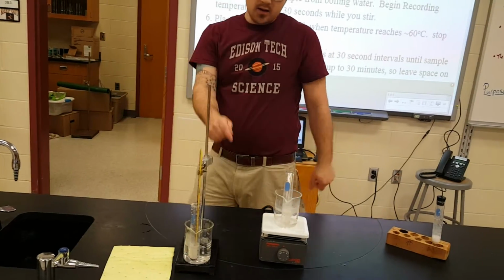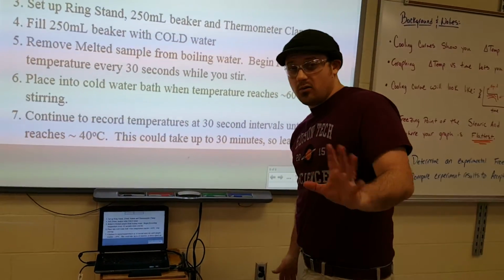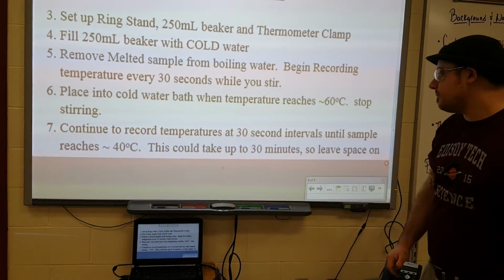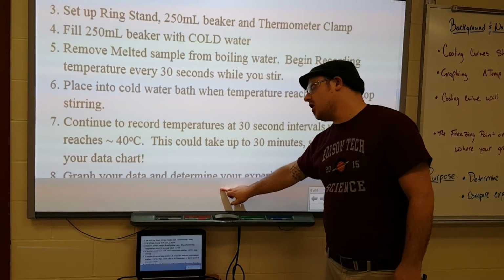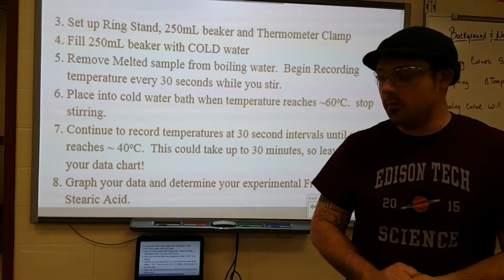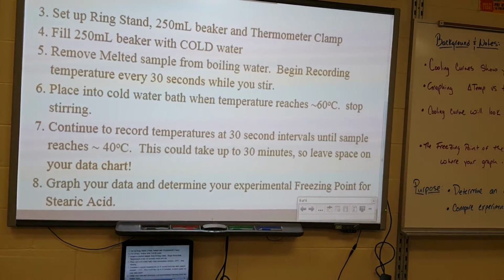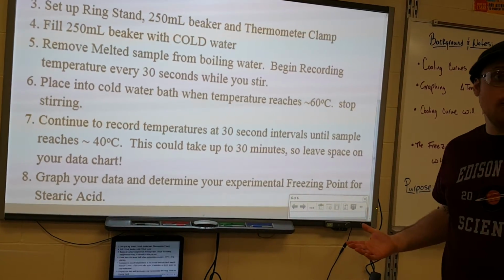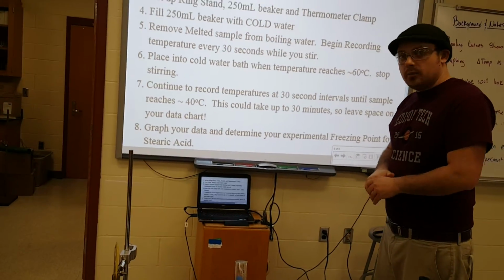You may have to replace the cold water after about 5 minutes. I don't think so. But in order to get down to about 40 degrees, you might have to replace it. Right. This could take up to about 30 minutes, so leave space on your data chart to have all that extra data, okay? Yep. Graphing your data and determining your experimental freezing point is the analysis part of this lab. And so you're going to have a cooling curve that you will interpret for your own results at this point.